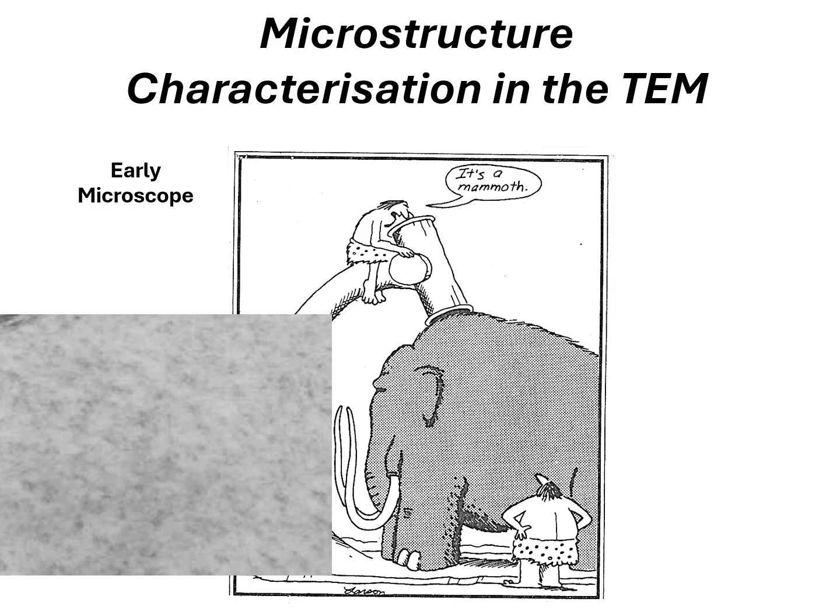He was doing some irradiation in a high voltage microscope, and he came in on a Saturday morning, came up to me and said, "Look, I can't get any images out of the machine." And he said, "Will you look at it?" And even though I was way junior to him, I said, "Okay." And I went down, and there was an image. He showed me, there was an image like this on the screen.